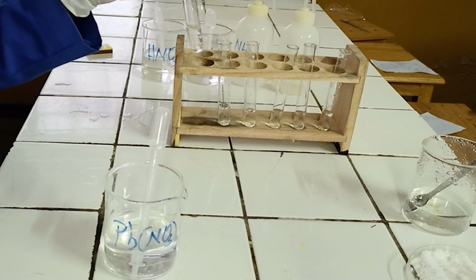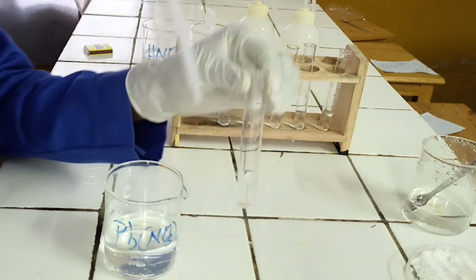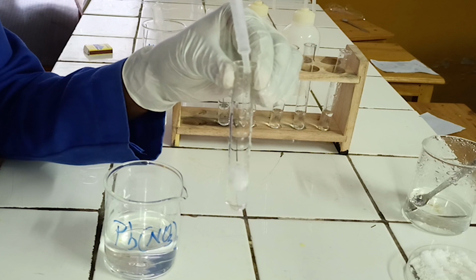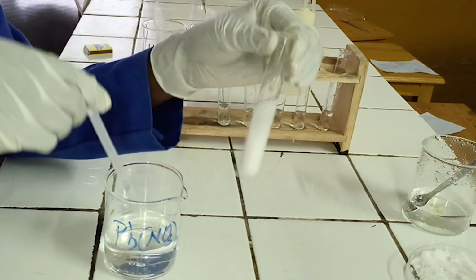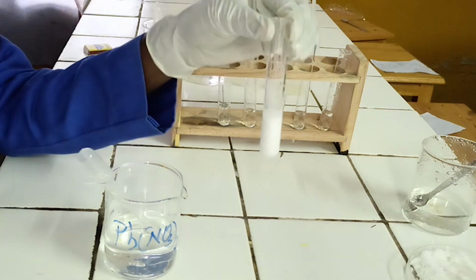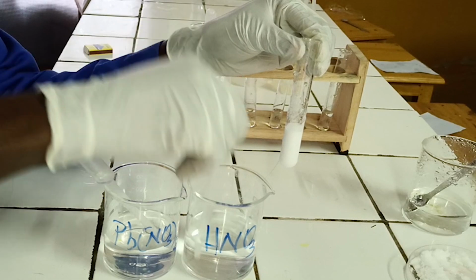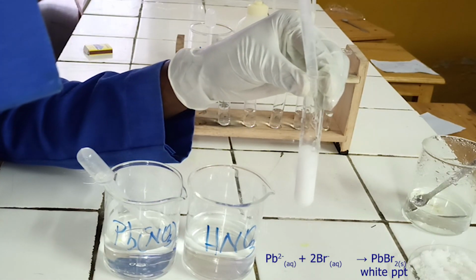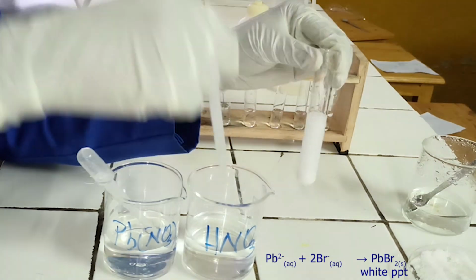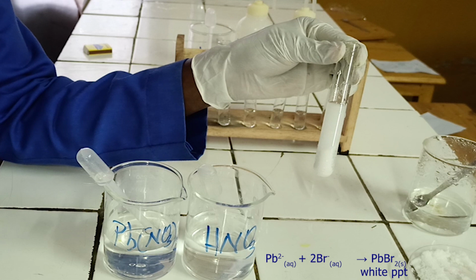To the first test tube, add a few drops of lead nitrate solution followed by diluted nitric acid. As you see, lead nitrate reacts with bromide ion to form a white precipitate. The precipitate formed is insoluble in nitric acid. Below, there is the ionic equation for this reaction.